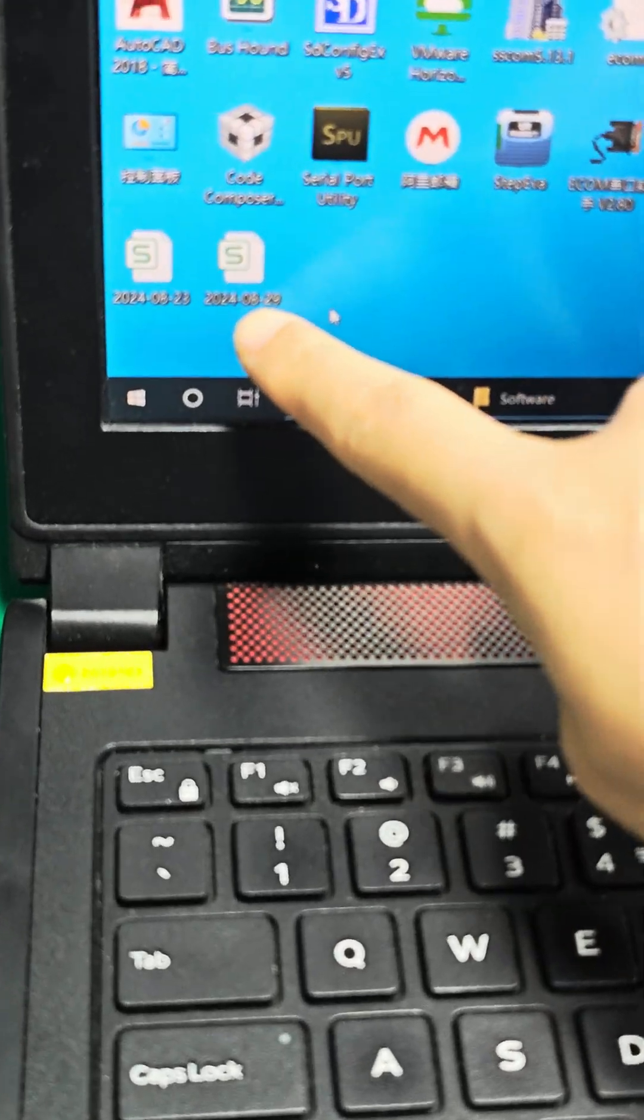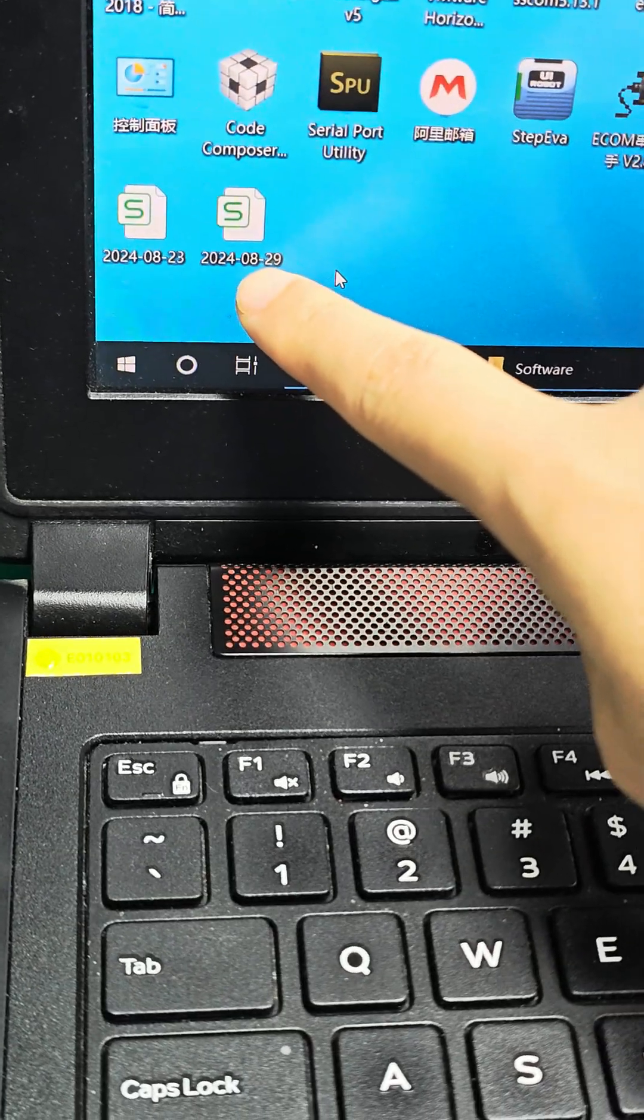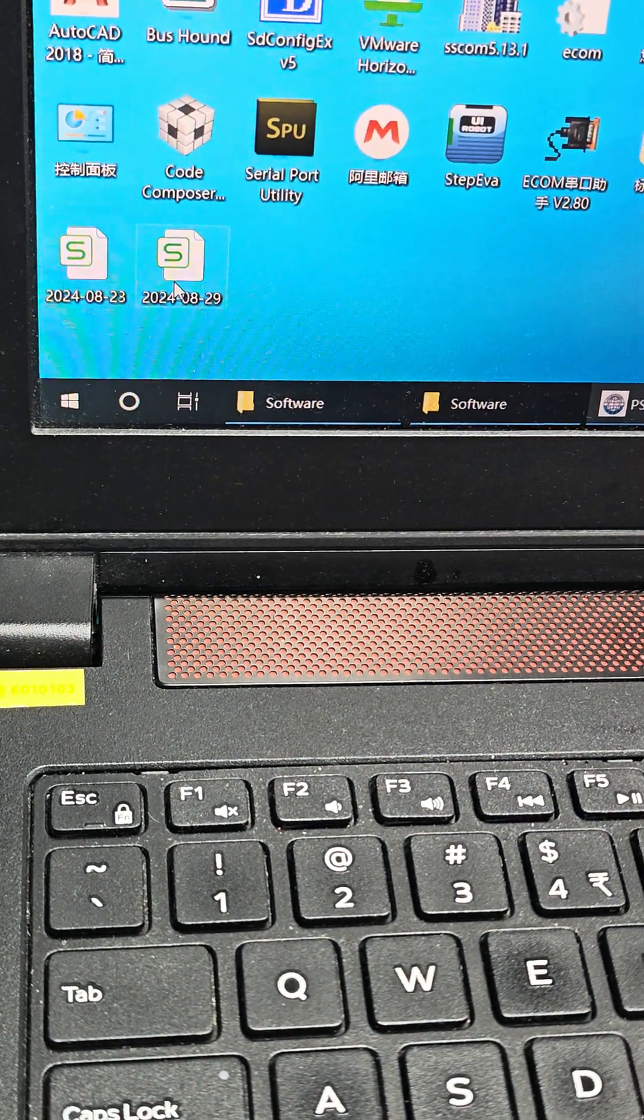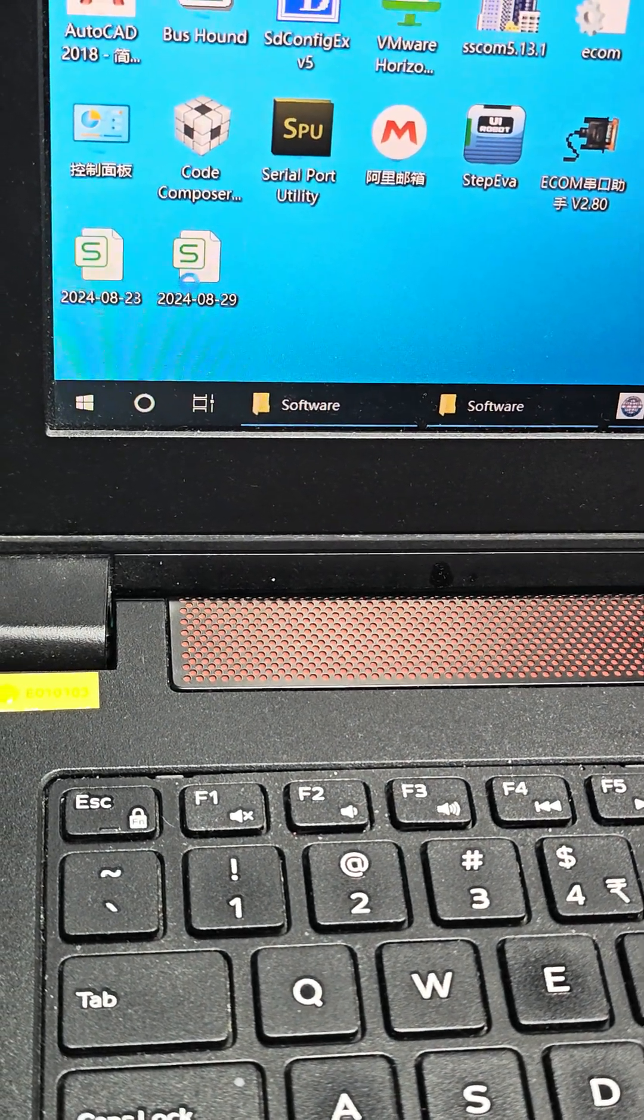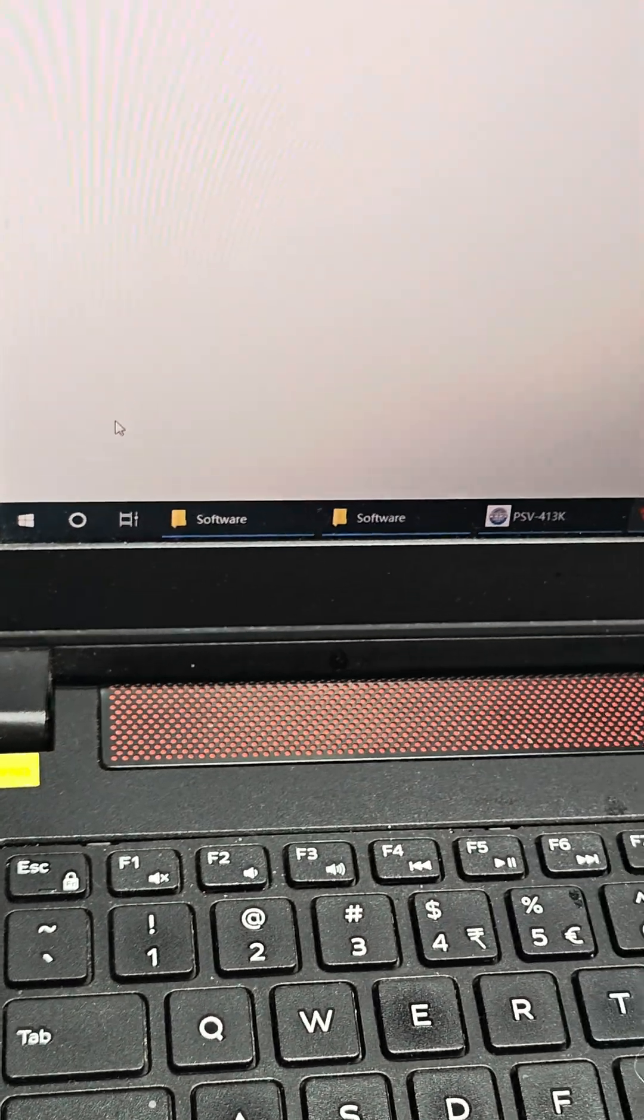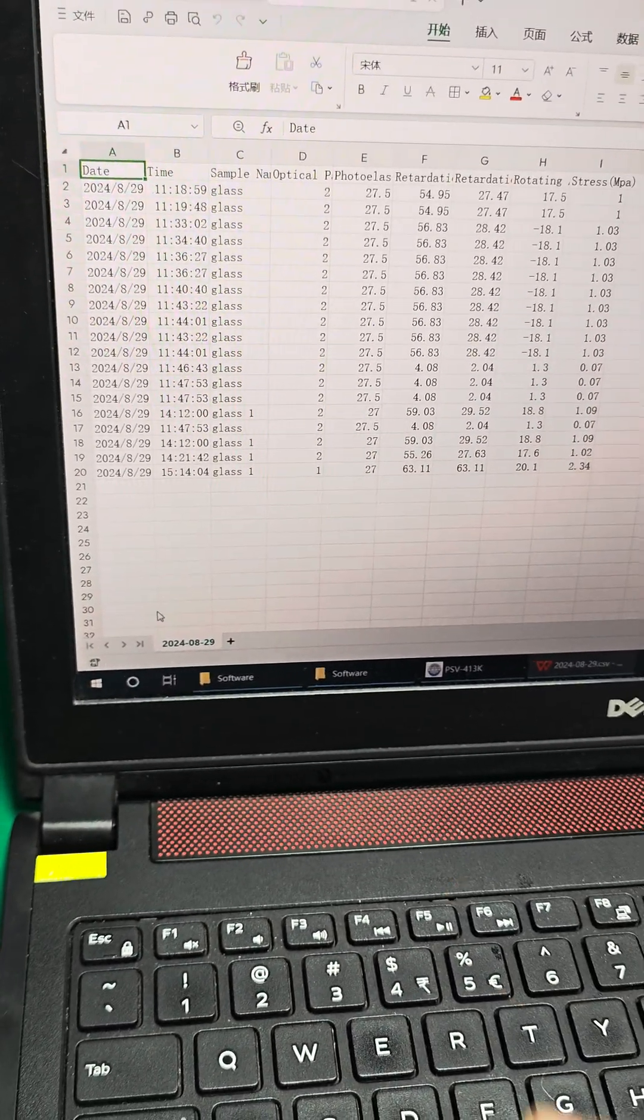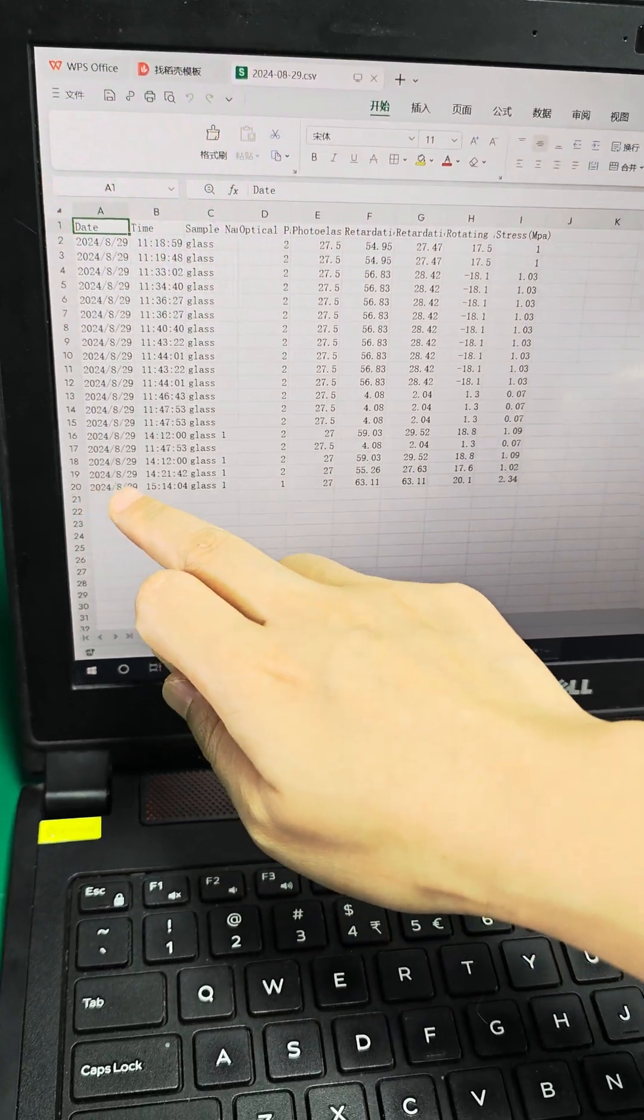Then a file will generate. Open this file, we will find the data we just measured here.